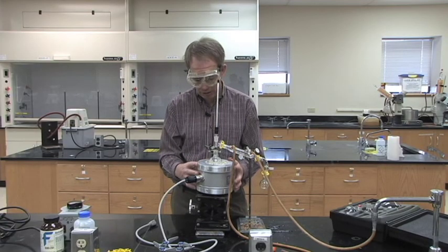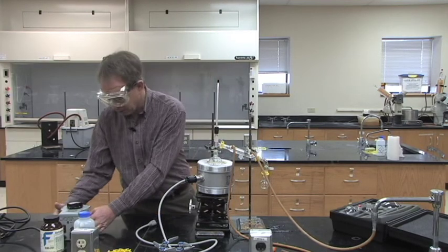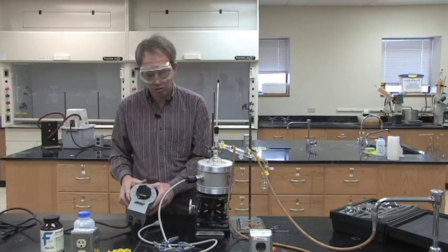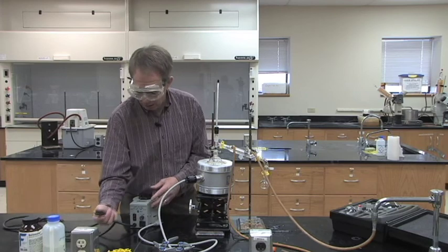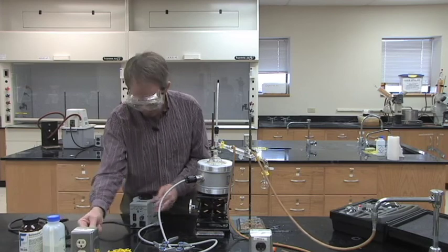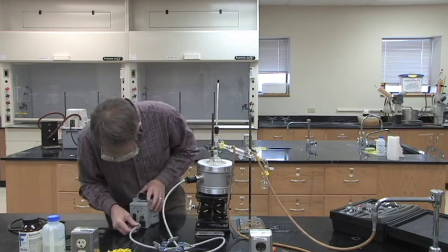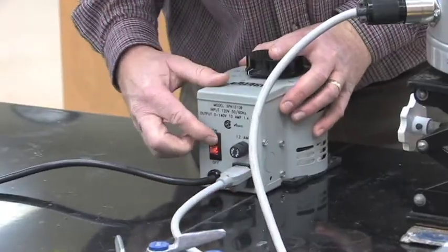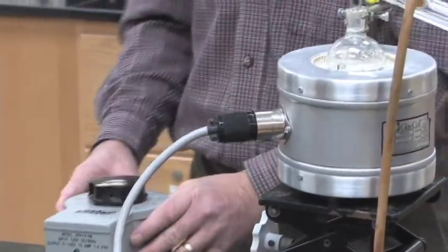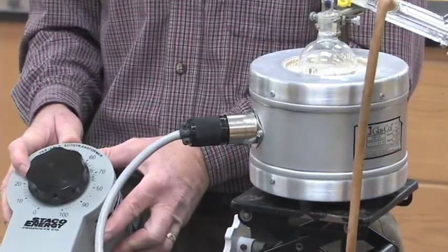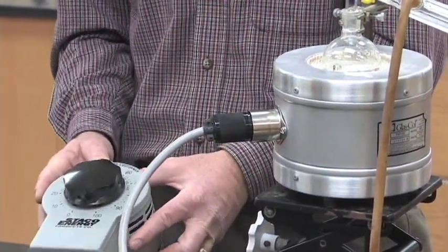Now the thermal well that we're using doesn't have a dial on it. So we have to go back to using a Variac to control the current in our thermal well. So we plug it into the standard wall outlet, plug our thermal well into it, turn it on, and then turn up the power to begin with somewhere in the 30 to 40 range and see what happens from there.